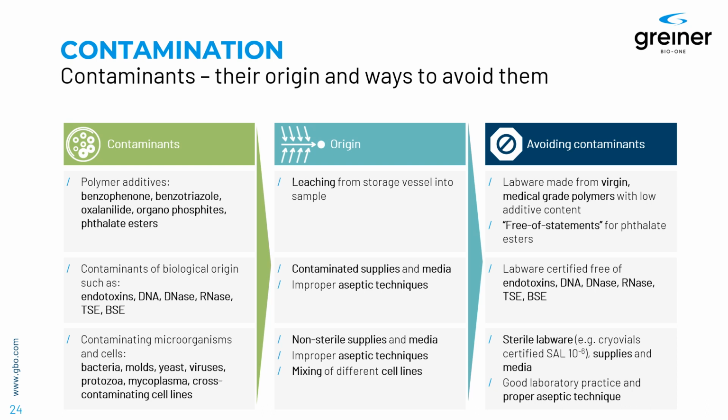In order to exclude them, you may ask your vendors for certification, which indicates that labware is made from virgin medical grade polymers with low additive content. And you can also ask for certain certificates. There is, for instance, a very common thing. It's a free of phthalate ester statement. And then you can be sure that these additives are not contained in the labware, in the cryostorage vial you are using.